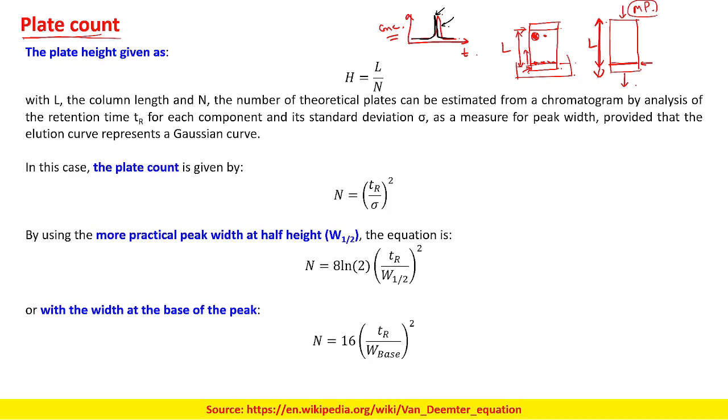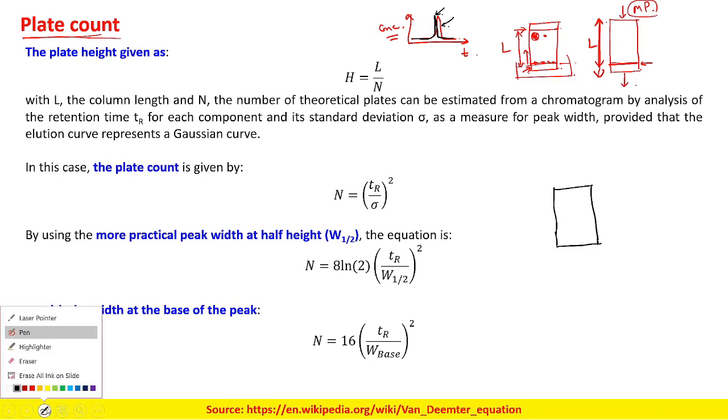Now how do we say whether the column has better resolution or not? When we have this column, we use a theoretical basis to divide the column.